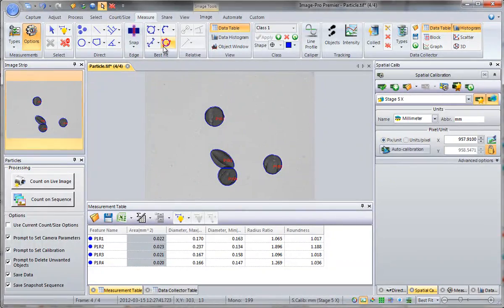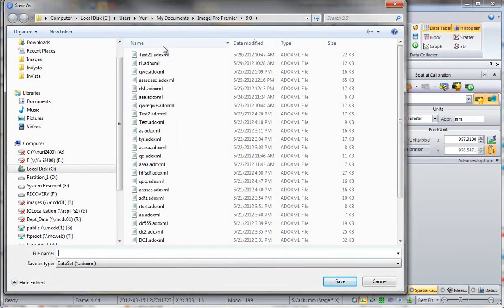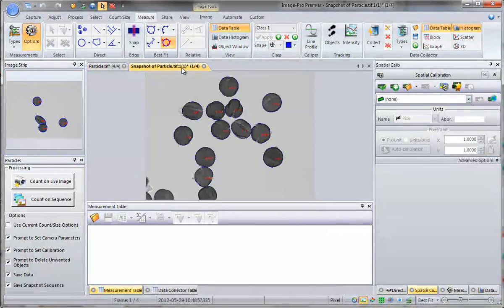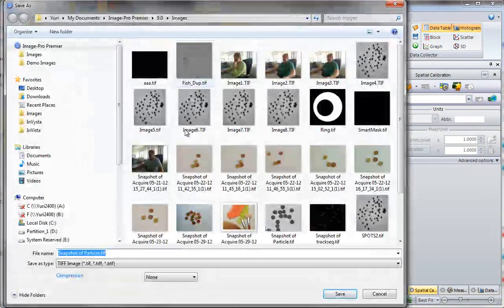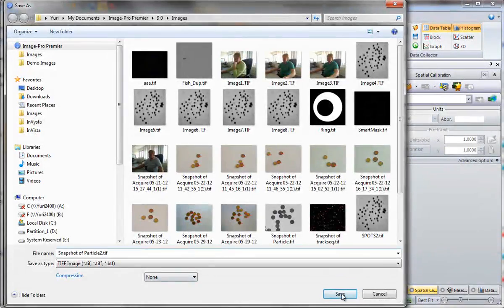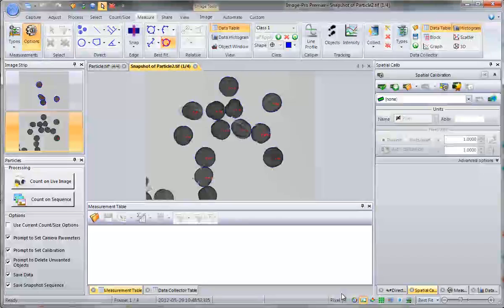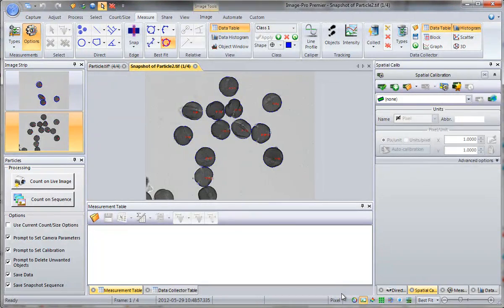Next frame, and we are done with this experiment. We are prompted to save data and a snapshot. That was all. Thank you.